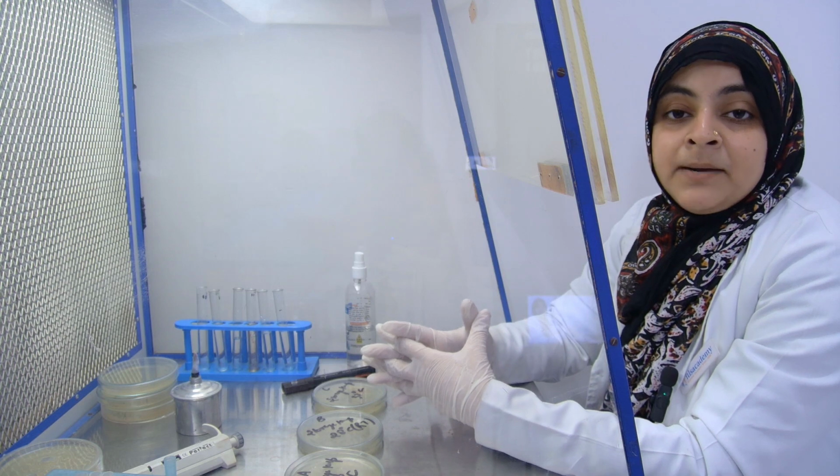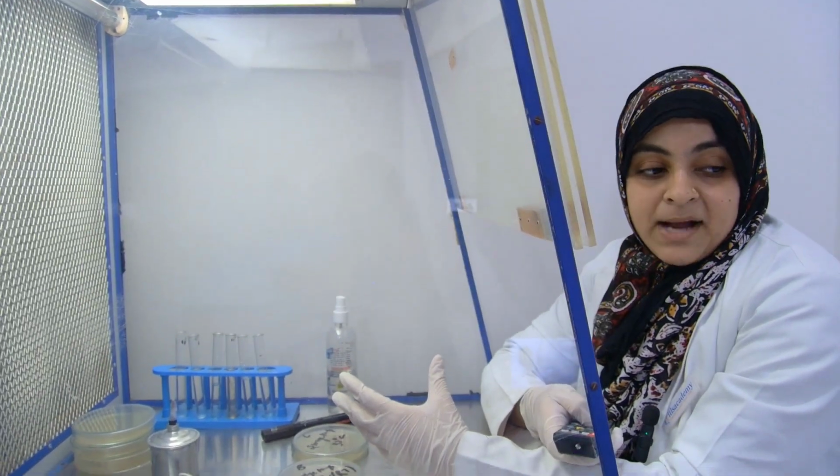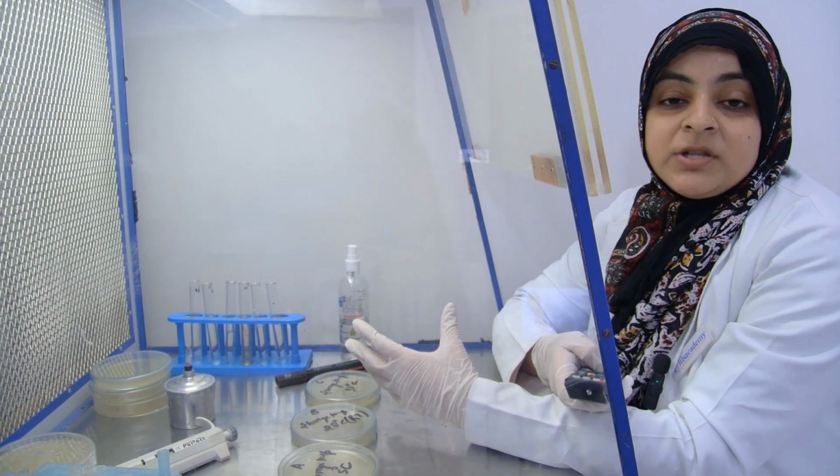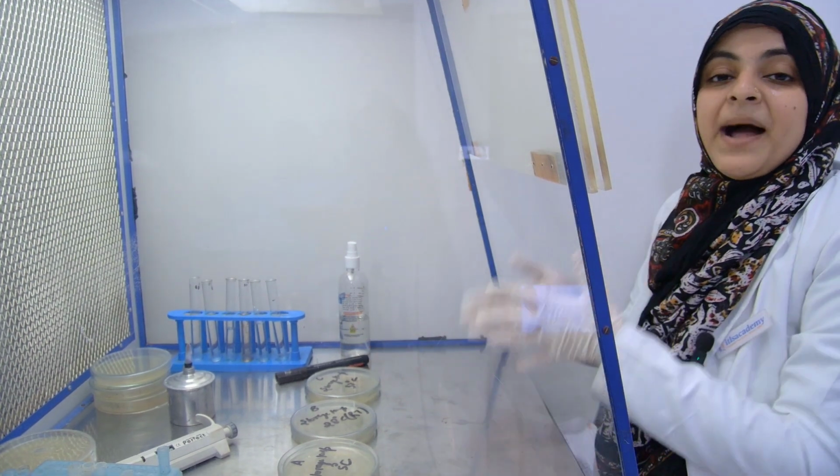But in the third Petri plate which was kept at 37 degrees Celsius, it shows maximum growth. So this is all about the effect of temperature on bacterial growth.